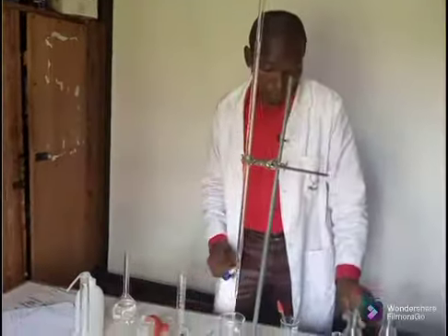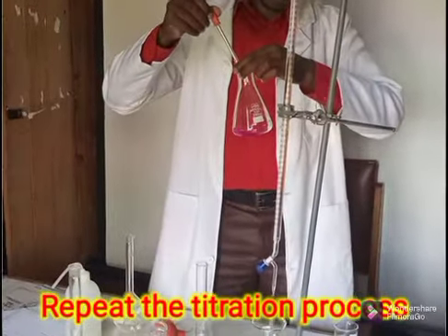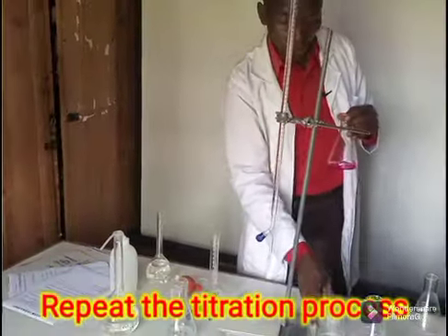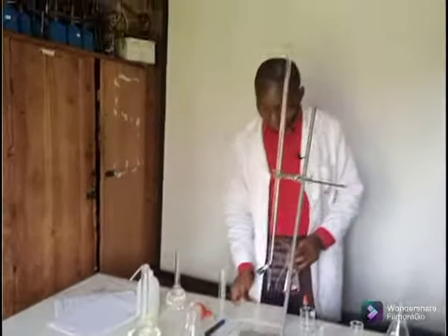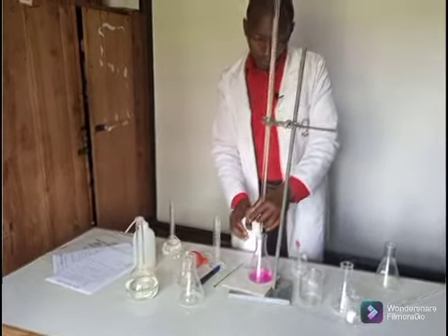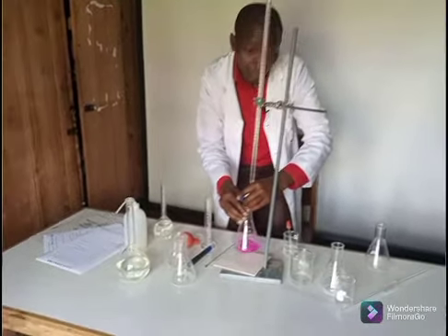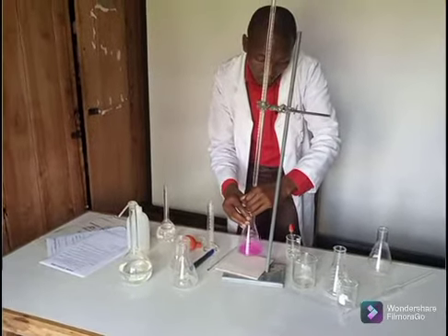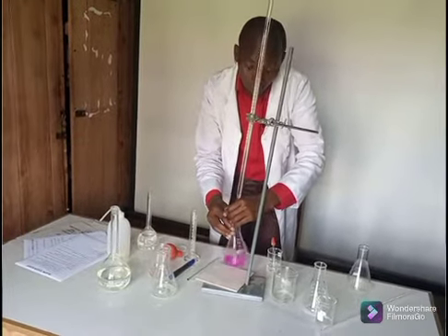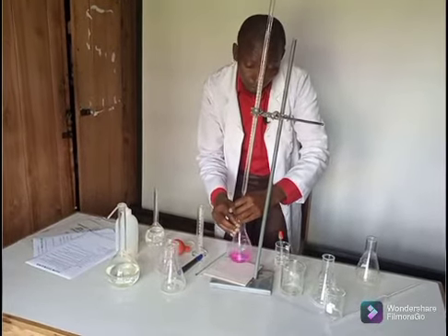Remember, now I'm going for my second portion. The second portion, again 3 drops of phenolphthalein indicator. And you can see phenolphthalein is pink in alkaline solution. Now I can go for the second trial. Again, I start the process. For this case, I know my volume is 25, so I can go directly up to 20 and then I stop it. So that is it.